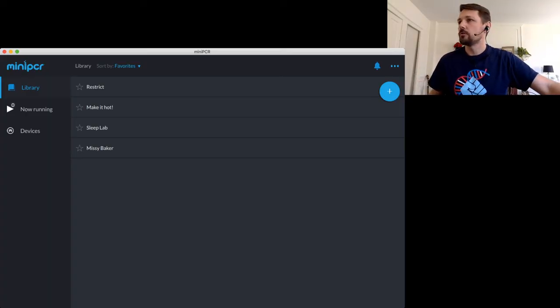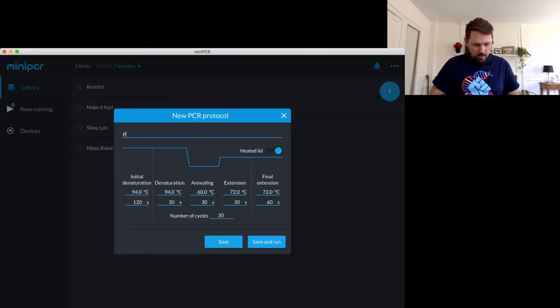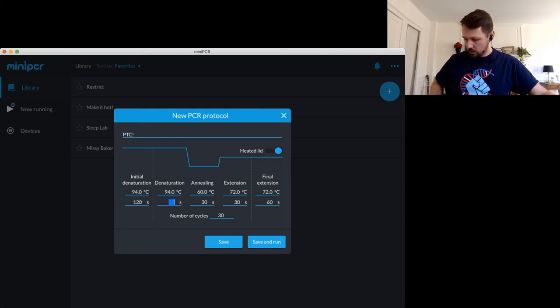So I'm going to just show you the program. We're going to do a new program. It's a PCR, PTC. We'll give it an exclamation point. All right, and then we said that the program was 94 degrees for 120 seconds, 94 degrees for 10 seconds.